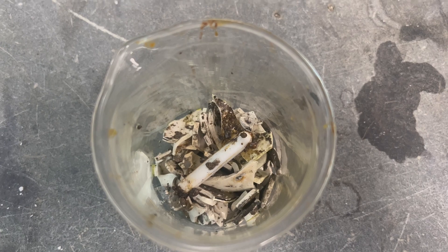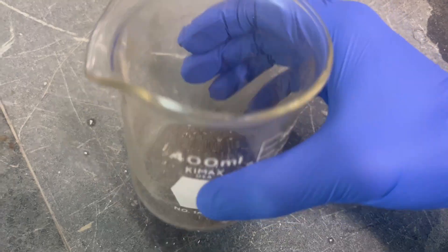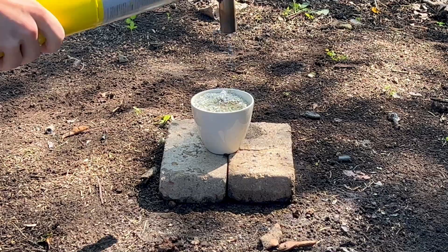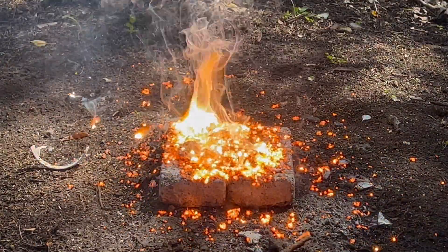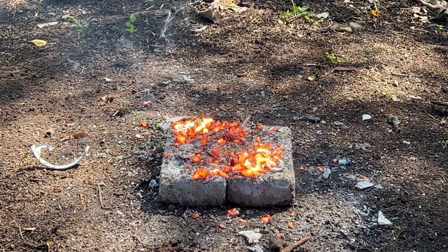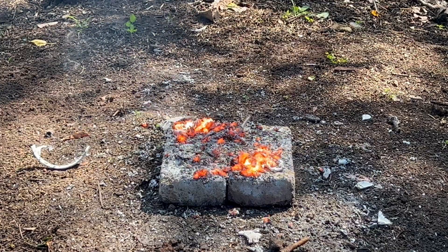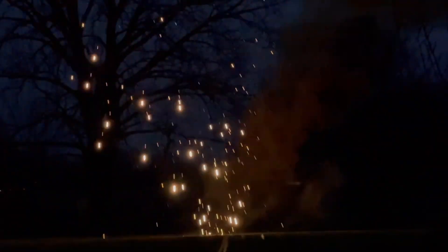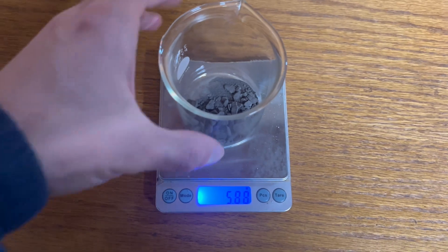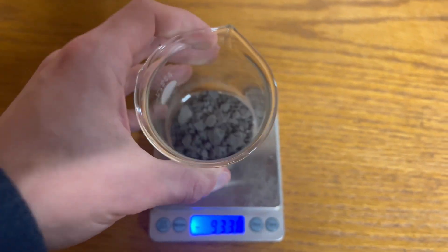Another significant problem with this reaction is it produces impure boron mixed with magnesium boron compounds. If I were to do this reaction again, I'd probably use thicker magnesium shavings to slow down the reaction and allow it to stay more contained in the crucible. It's important not to use magnesium powder, as it could explode, like seen with copper thermite. Now dry, here is our final boron product: 5.88 grams of boron.